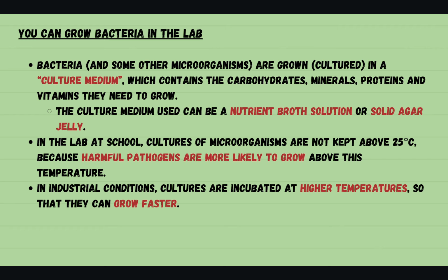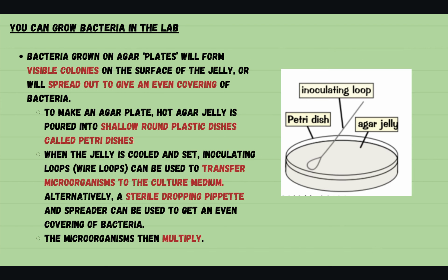In the lab at school, cultures of microorganisms are not kept above 25 degrees Celsius because harmful pathogens are more likely to grow above this temperature. In industrial conditions, cultures are incubated at higher temperatures so that they can grow faster.